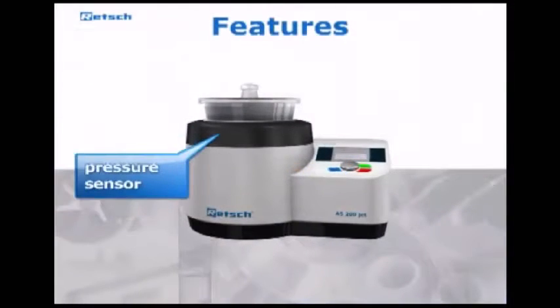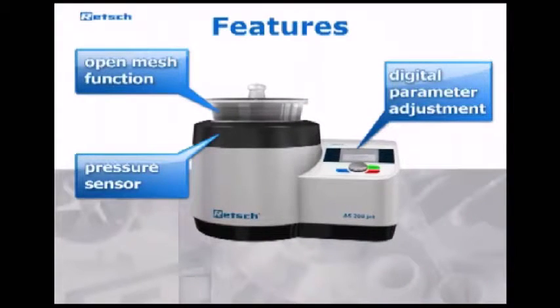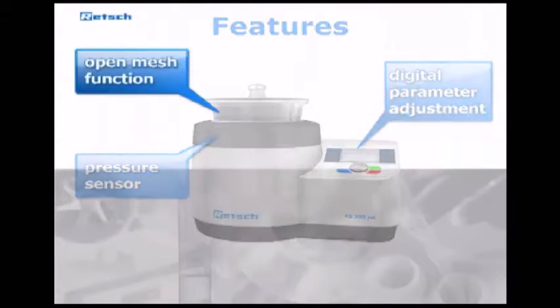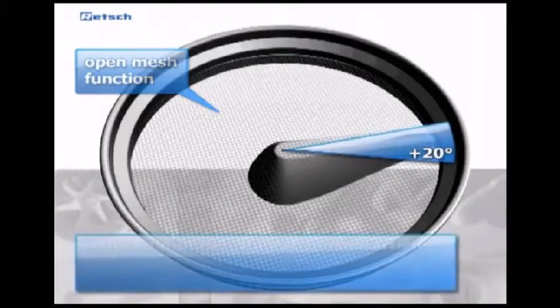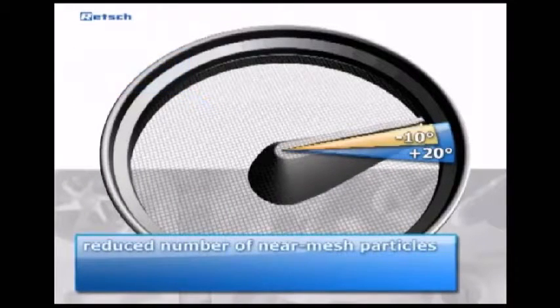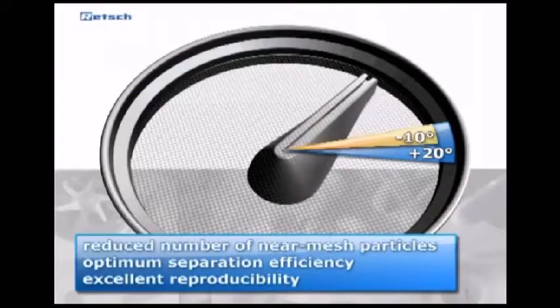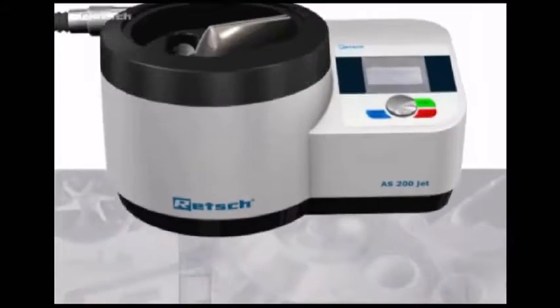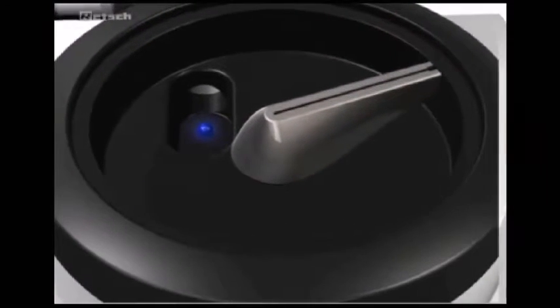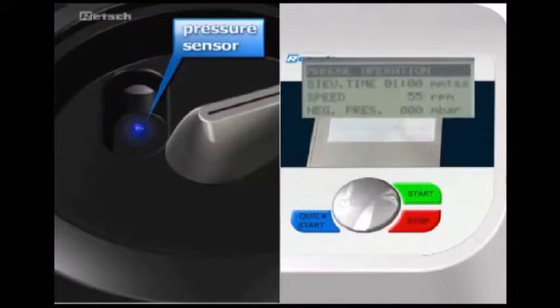Thanks to some special features, the AS200 jet allows for extraordinarily reliable and reproducible sieving processes. The open mesh function, a procedure which greatly reduces the number of near-mesh particles, provides optimum separation efficiency and excellent reproducibility. A highly precise and sensitive pressure sensor inside the device constantly measures the negative pressure. The value is indicated on the display.